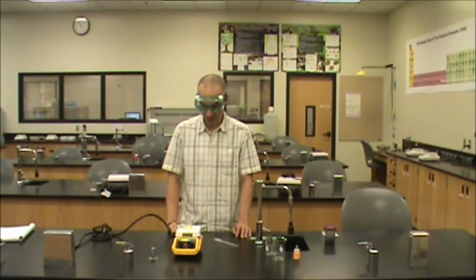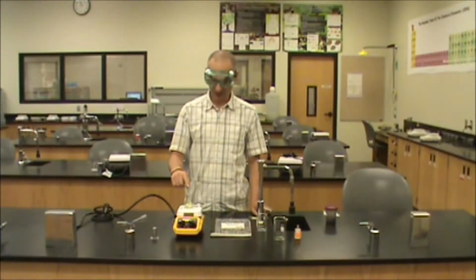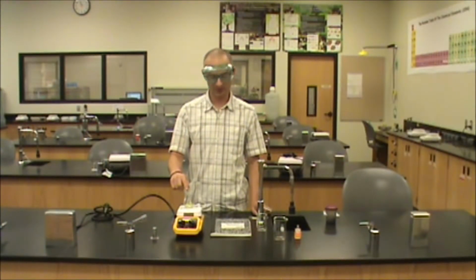I'm now going to turn on the stirring. Our goal is to dissolve our compound in the minimum amount of solvent possible. This is going to prove to be a bit of an art. If your compound's not dissolving, just simply add a bit more solvent. And if you add too much solvent, you can allow some of it to evaporate over time. You want to maintain a temperature where you're right at the edge of boiling. If you're boiling too fast, the solvent evaporates quickly. And if you're below the boiling point, it's hard to judge the temperature. Your temperature might actually be too low. I've continued to transfer solvent into our small Erlenmeyer flask until our compound is completely dissolved.